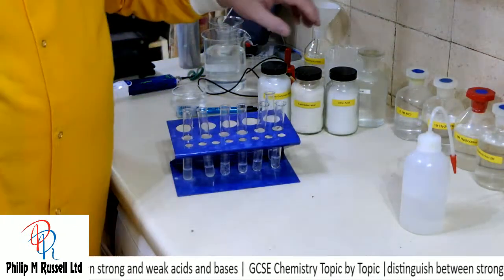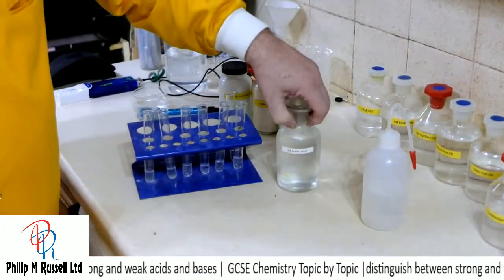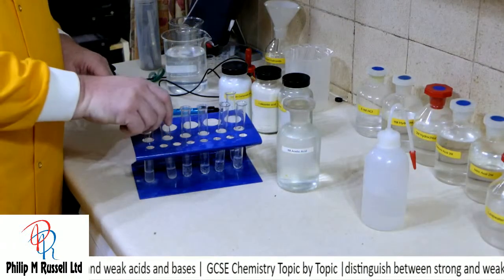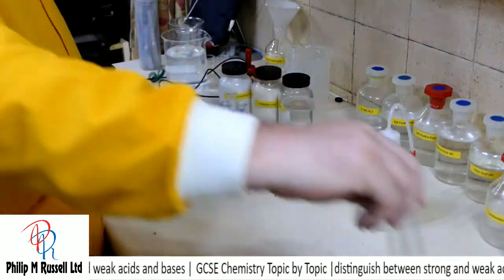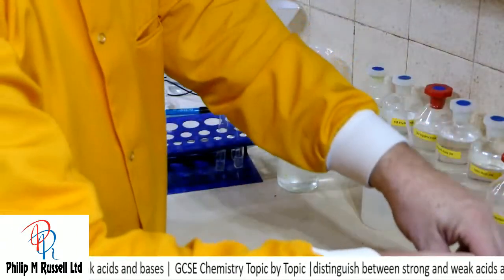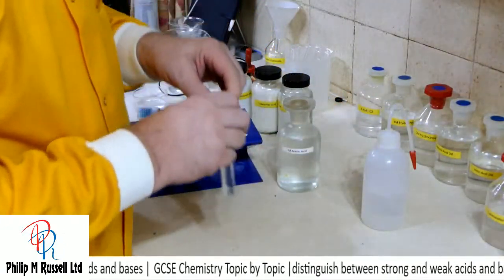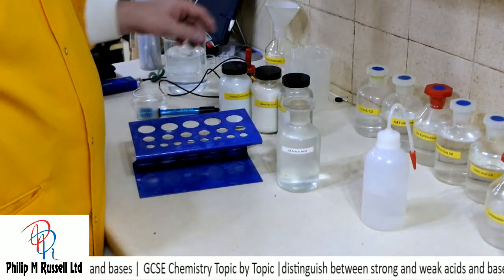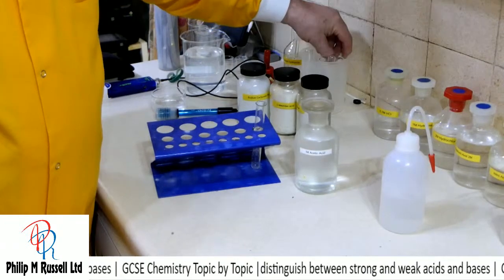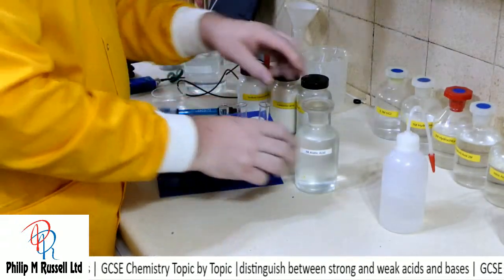So there are our acids. Let's compare that with a different acid. Now this is acetic acid. Now this is generally what I would term a weak acid. And this weak acid I would be actually prepared to put on my fish and chips. What we're going to do is have a look at how this one works.